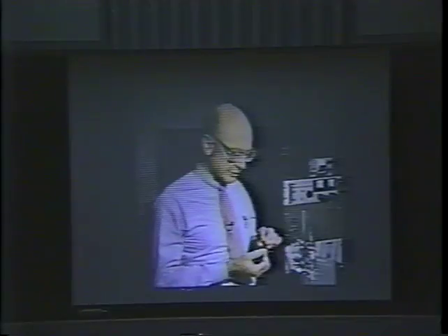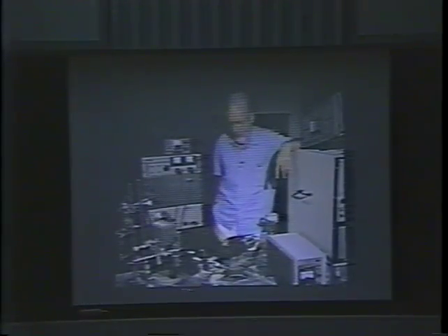and made a trip out to visit Dick Sweet at Stanford Research Institute. In the summer of 1963, he came out and visited me and told me a bit about his work. And we had some conversations which were interesting to both of us, I think. I knew nothing at all about cells at the time. And he went back to Los Alamos with some borrowed equipment of mine and started work on what became the first cell sorter.